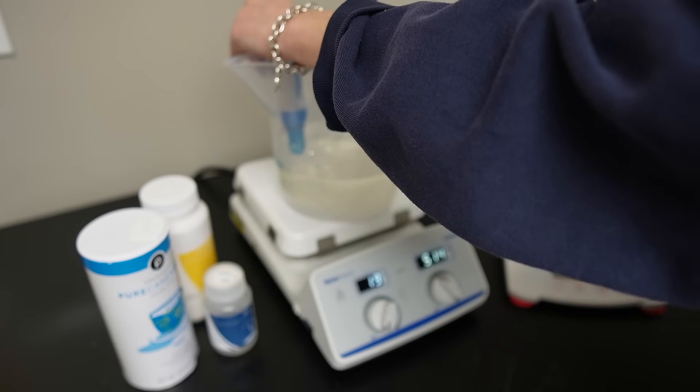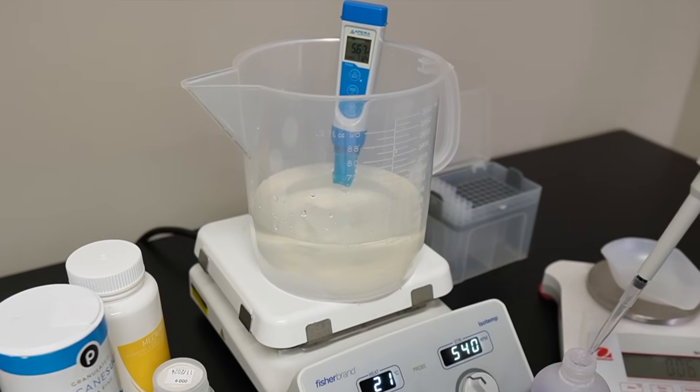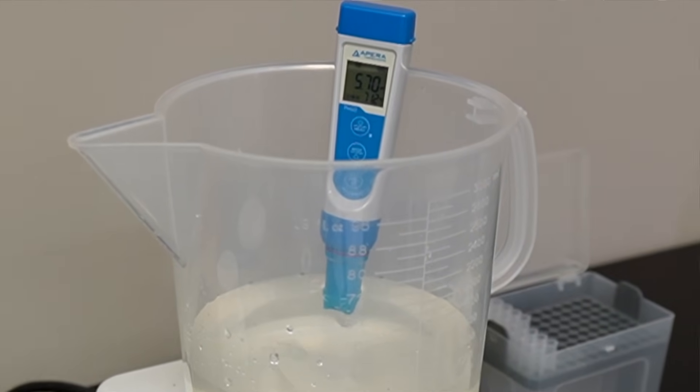Another tool that you need to do tissue culture is a pH meter. The media typically needs to be around a pH of 5.7. To do that, I use a pH probe like this one — this one is an Apera pH probe. While I do like it, I do think it is pretty overpriced, around $100, which is crazy. I've used the Bluelab and generic ones, but I do prefer the Apera. I think it holds the calibration better than other probes that I have used.